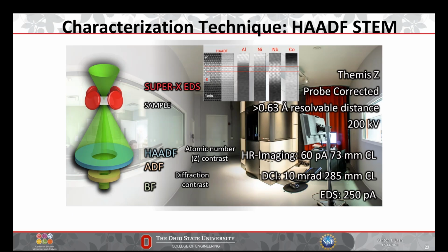So to maximize counts in EDS, you'd basically want there to be no tilt at all so that you can get the most counts. You want a high amount of counts, a good signal to noise ratio, because it takes a decent amount of time, the sample drifts a little bit, and so you want this to happen in some reasonable, feasible time. So that's one of the reasons.